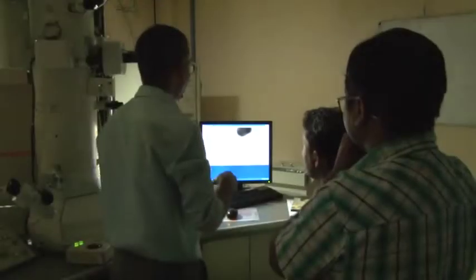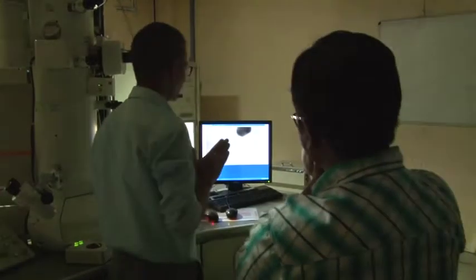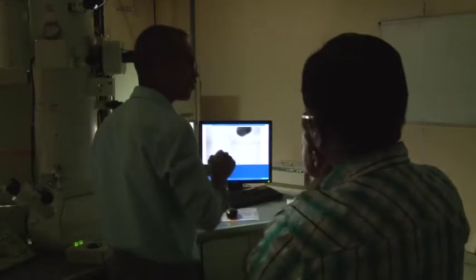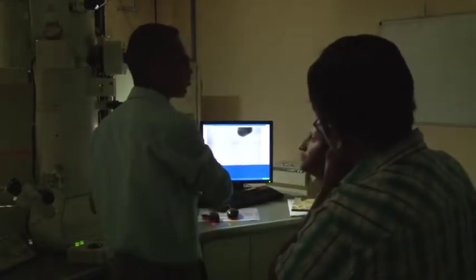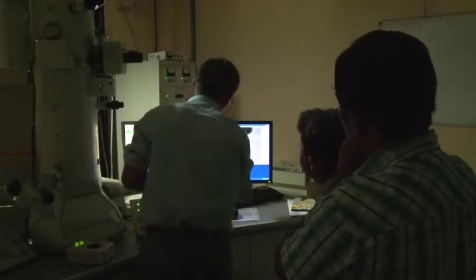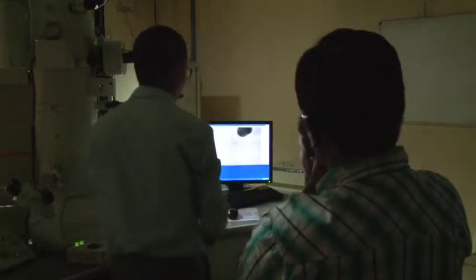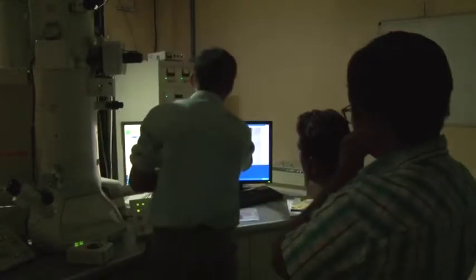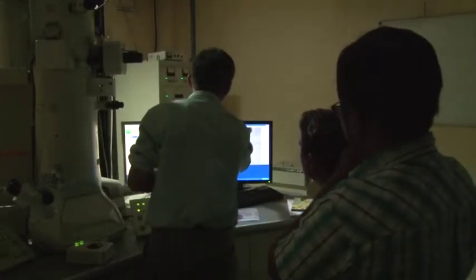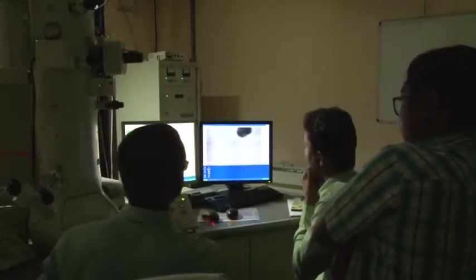A fringe is an indication that one is away from focus, but if that fringe is not uniform, that is an indication that there is objective astigmatism. Right now I would say it's not that bad because it is more or less uniform. It does look like this side is more prominent than that side, so there may be a little astigmatism, but by and large this is okay.